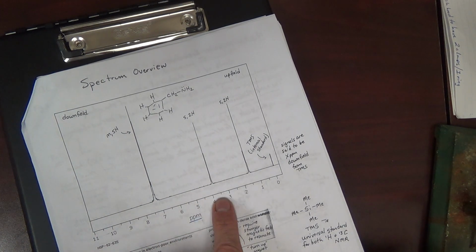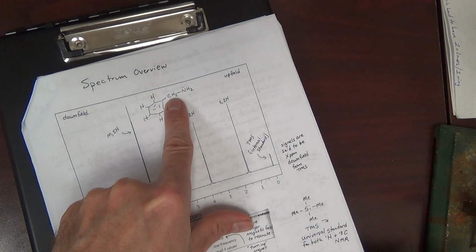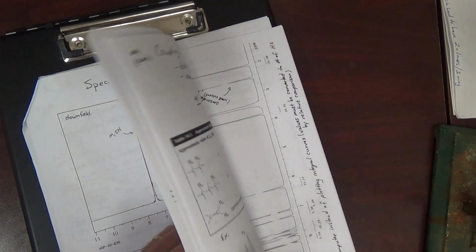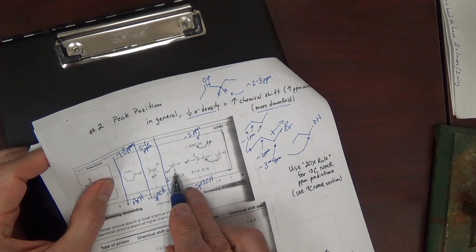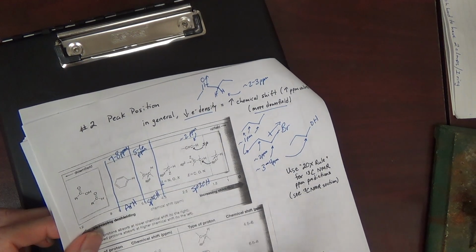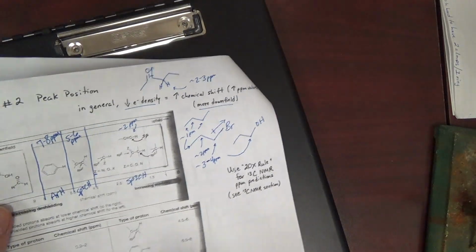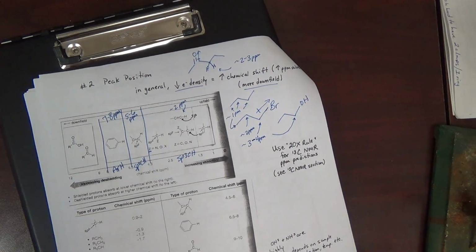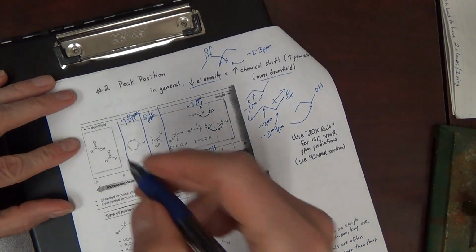We got a signal in this 3 to 4 range. That'd be the CH2 because it's bonded to the nitrogen. That would be an example of such where the Z group is a nitrogen. Then we have the NH2 group. That's going to be a little bit more variable, and we haven't mentioned that yet. Okay, a couple of outliers.